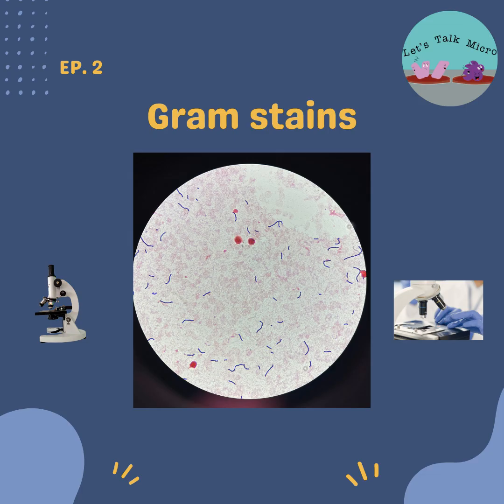At this point in time, there's bibulous paper, bib paper. You put it there to dry your slide. Sometimes I've seen techs use a little paper towel and put it on the warmer for a few seconds to get rid of the excess water, and then you are ready to look at it. It's a very simple procedure. There are several automated stainers that will do it for you out there.